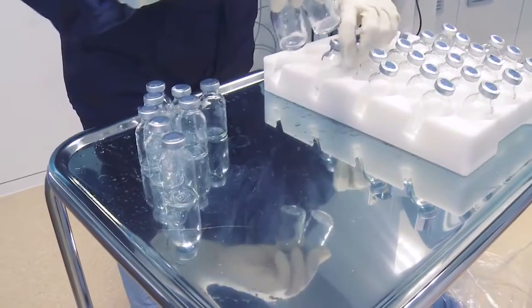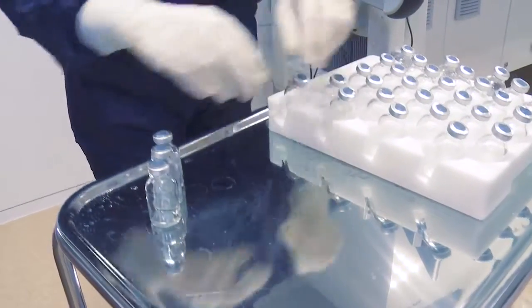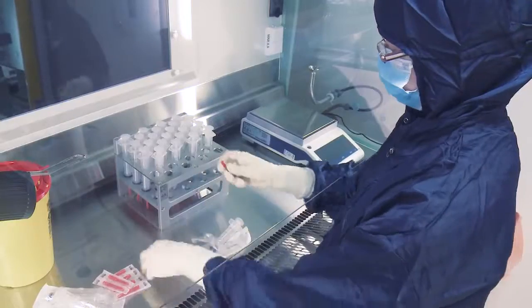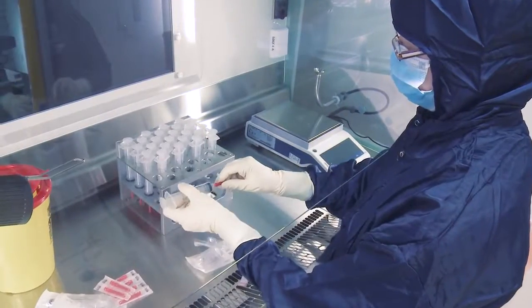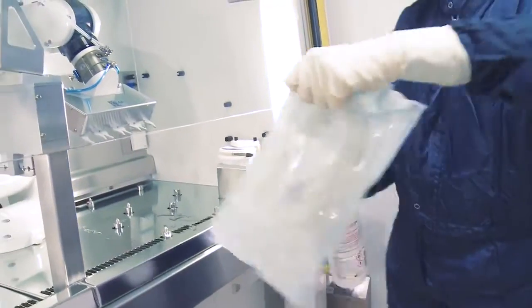First, the user places the dose vials on the trays. Needles and syringes are prepared in a separate cabinet. The required instruments are placed in the cabinet.